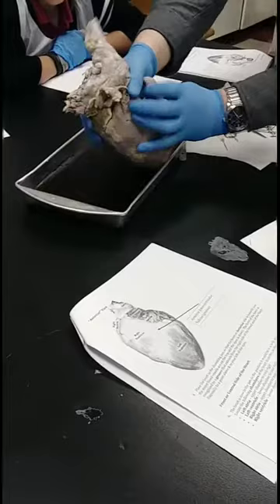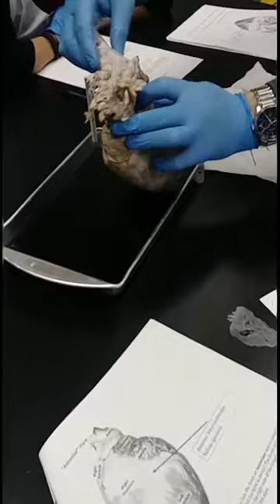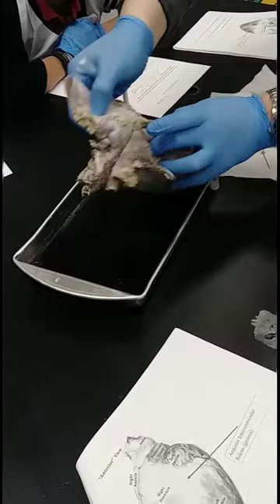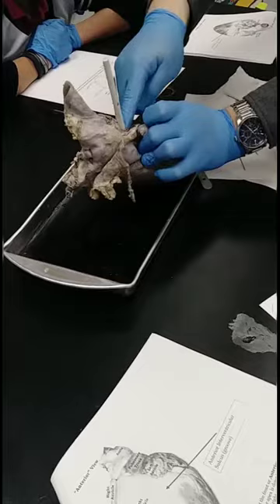On this, again, you have to open up a little bit. It's a little squished from being packed. But this whole big, thick thing here is the aorta. That's how thick it is. All right. That continues all the way up here. Okay. And these thin things here, the veins are a lot thinner than the arteries. That's one of the pulmonary vessels we were talking about. See that? See how thin it is?